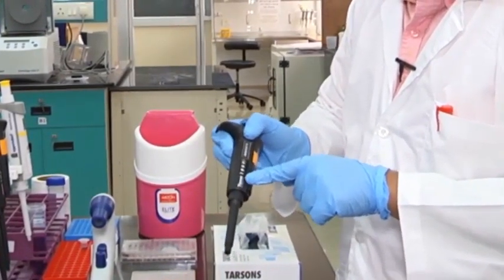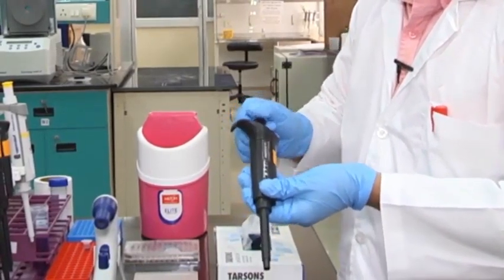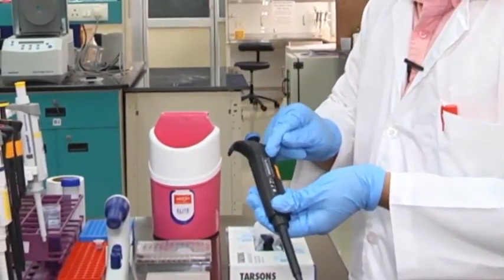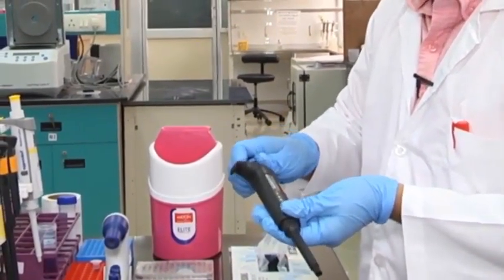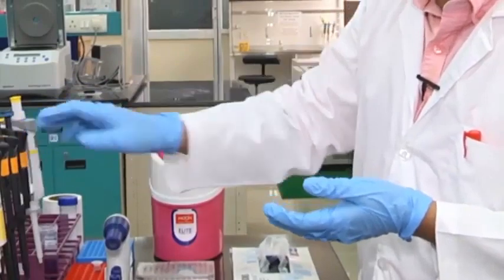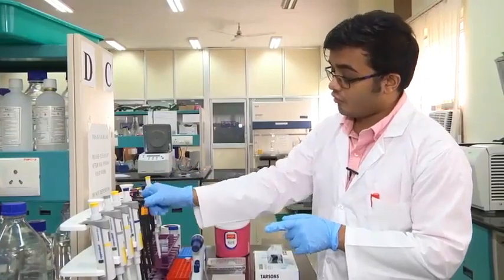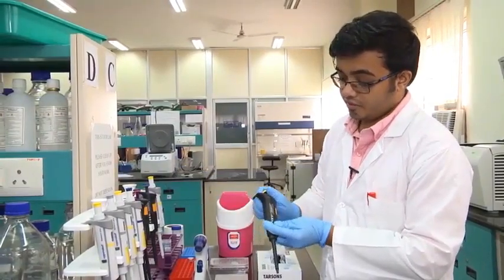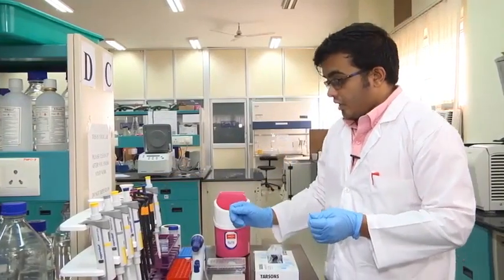Always release it or keep it, when not in use, at 1000 microliters. Any other volume that you keep it at will cause undue compression on the internal mechanisms and damage your instrument. This is applicable for all the different pipettes here. For 1 to 10, it will be kept at 10 microliter when not in use. For 10 to 100, you keep it at 100 microliter when not in use, and so on.